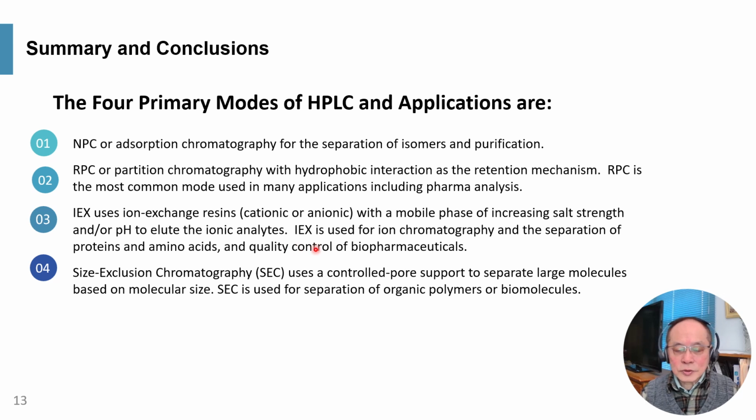Ion exchange chromatography is used in the separation of ions in ion chromatography or separation of proteins and amino acids. Also used in quality control of biopharmaceuticals.